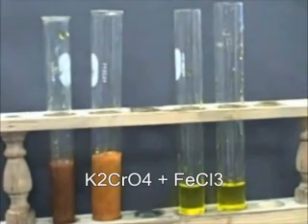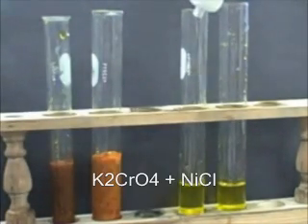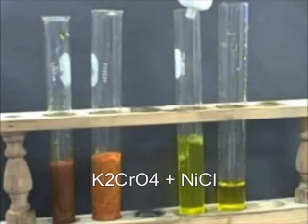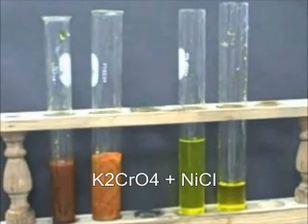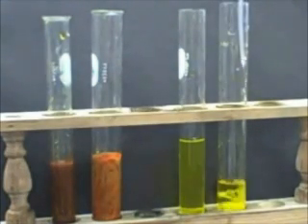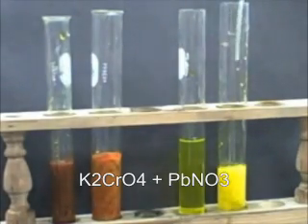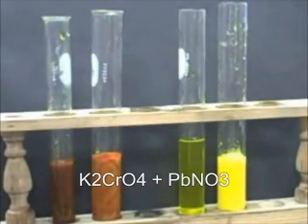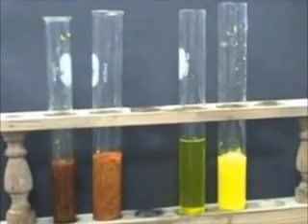We have no rules about chromate ions in our solubility rules, but this is just an example that other materials are also insoluble. The last one we mixed, the third one, is the nickel chromate. The nickel chromate has a degree of insolubility, but it appears almost completely soluble. There's some cloudiness, but not nearly as much as the first one, the copper sulfate, the second one, the addition of iron chloride, and the fourth one, the addition of lead nitrate. So we're seeing the copper chromate, the iron chromate, and the lead chromate all precipitating out.